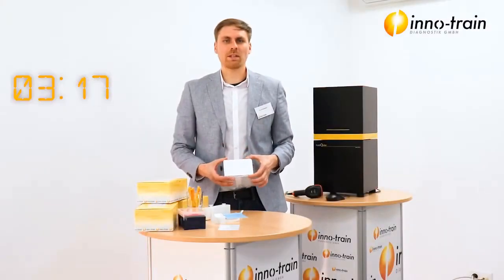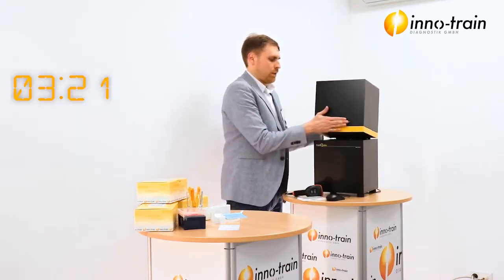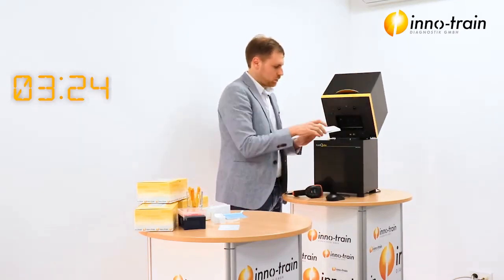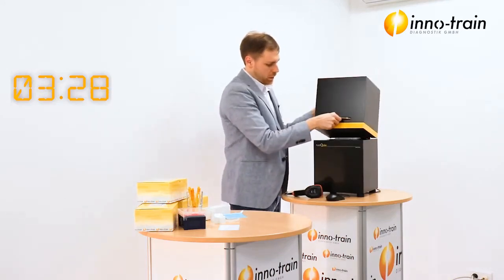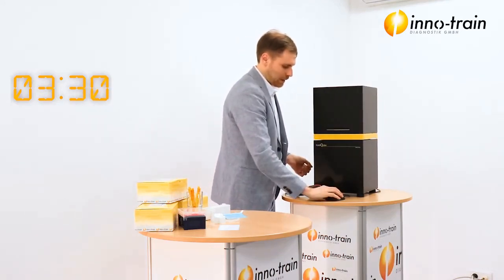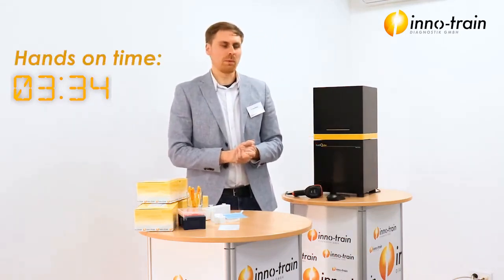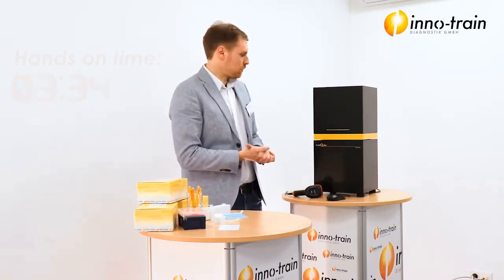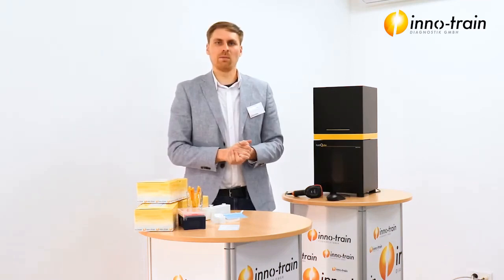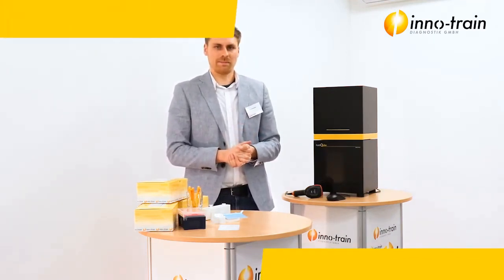So our centrifugation is done, and now we will put the plate in the Flu cube. Just open the Flu cube. Add your plate with the sample in here. Press start. We can stop the time, and that's all you have to do for providing your HLA typing with the 384 cube. So let's meet back here in 54 minutes and we'll see the result of our typing.